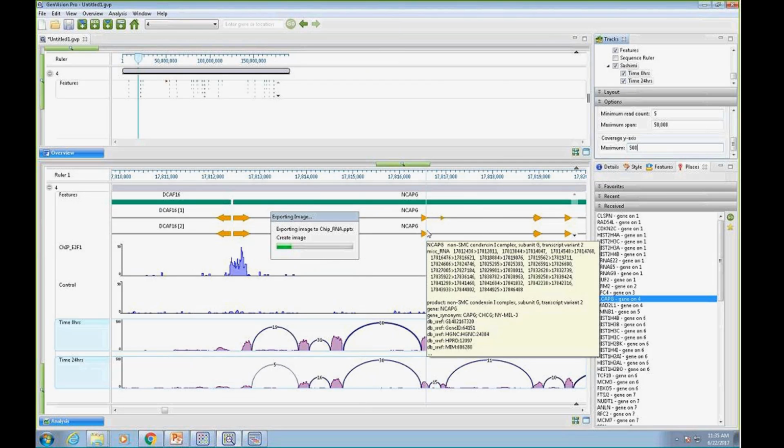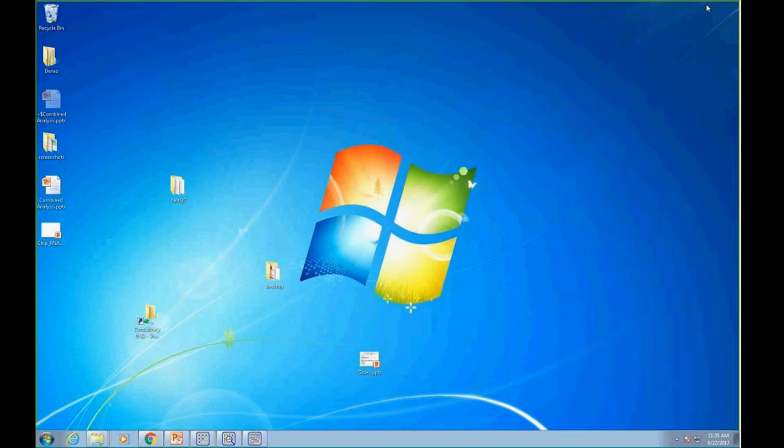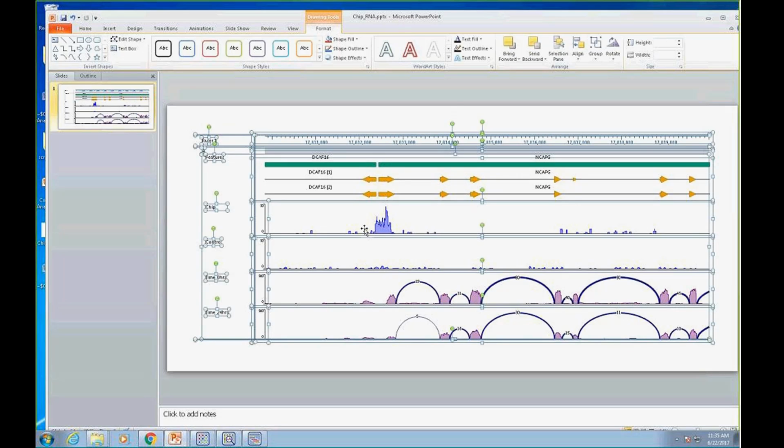All right, so I can save that range. There we go. So that's the image that's out. And of course, these are all objects too now. So if I need to change text, I can change this again. It allows me to edit that image very easily. Every one of these little pieces is going to be editable. I can ungroup this, and if I need to fine tune this image, I can start ungrouping and make edits and make just the exact kind of image that I want.